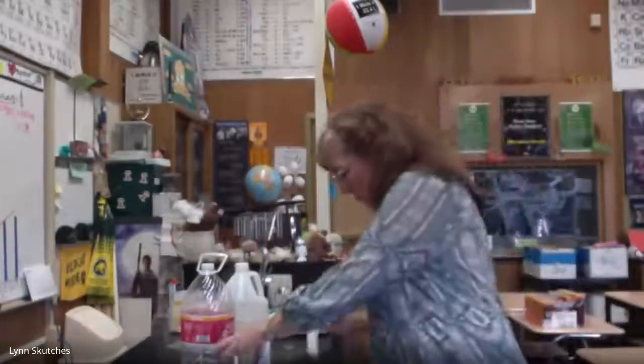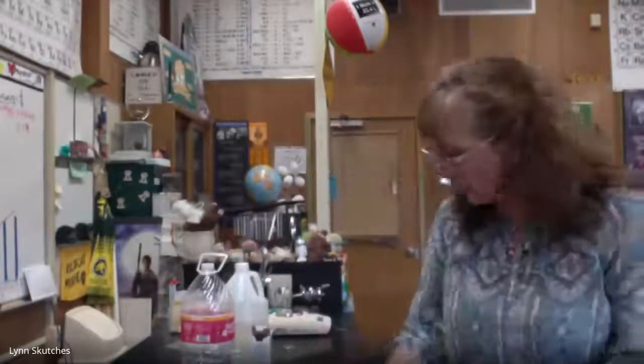Okay, so those three: water and salt, water and baking soda, vinegar and salt. Those should all be physical changes. Let's see if a temperature change happens. The last one's a little trickier, and that's for the chemical change.